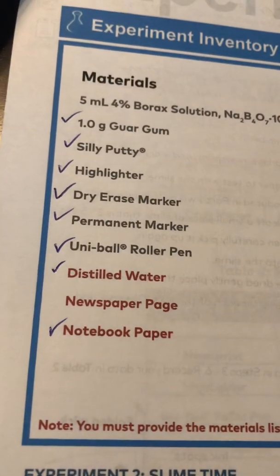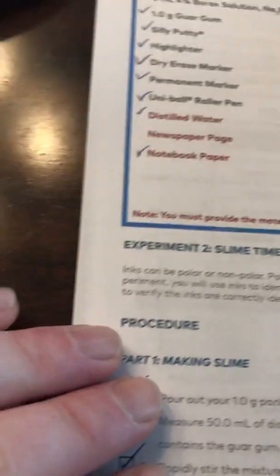Let's move on to a brief overview for the experiments. We're doing exploring solubility this week for the lab. This one was kind of interesting as well. I've done the putty thing before as a kid, the silly putty. Never had to make my own. We're using the guar gum to make basically our own slime. I thought was really good. I've never done anything like that before.